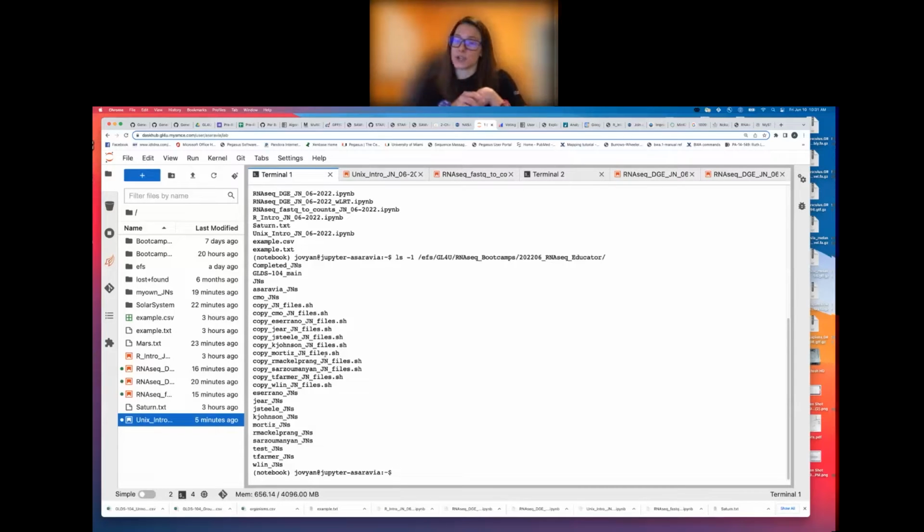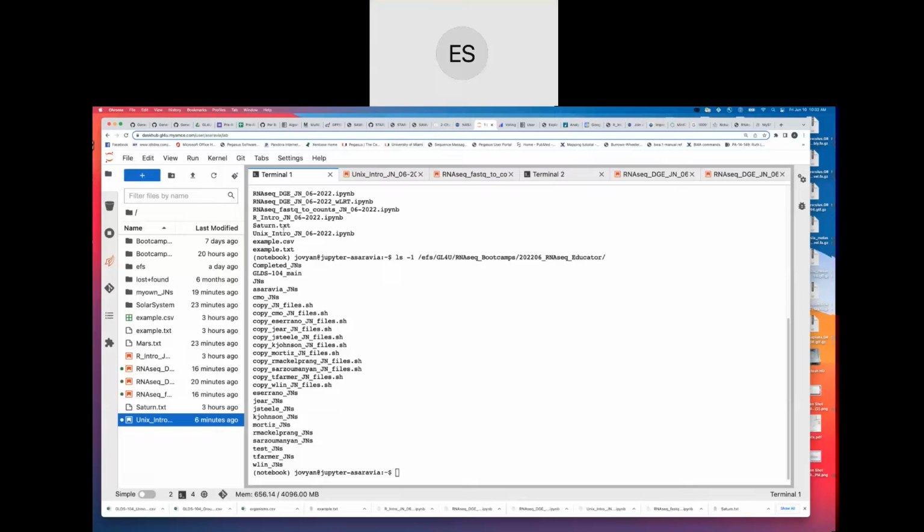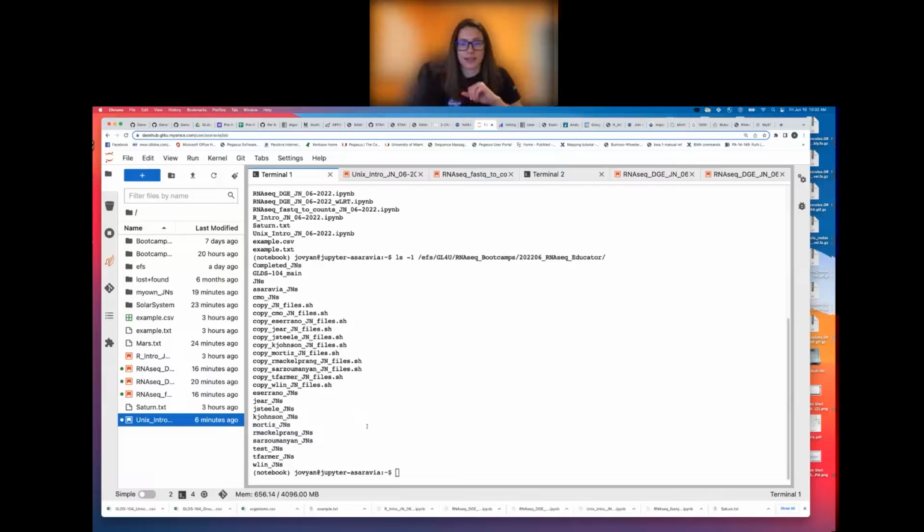And I have those instructions written on GitHub, which I'm going to go over now. Is everyone good with copying files into the system, this EFS location? Okay, great. Will they be able to overwrite one another's notebooks with a similarly configured system? Yes, you can. Unfortunately, that was one of the caveats we asked about. So please make sure that you are only writing into your directory and not anybody else's.